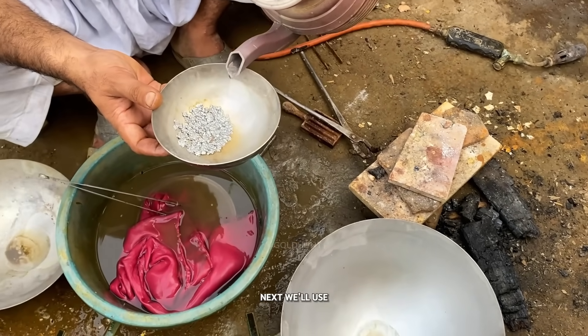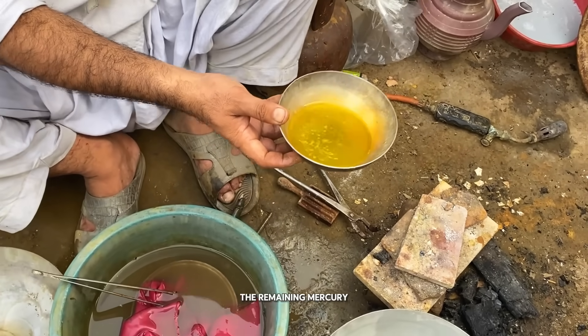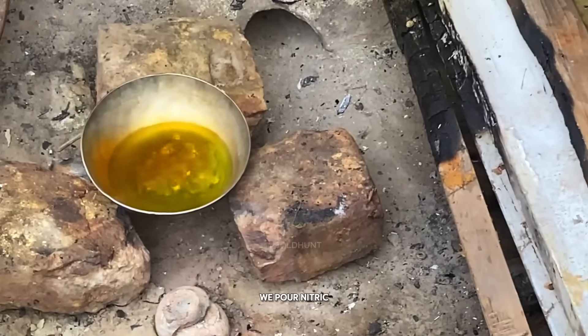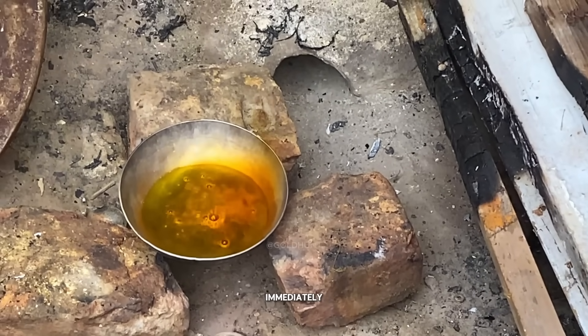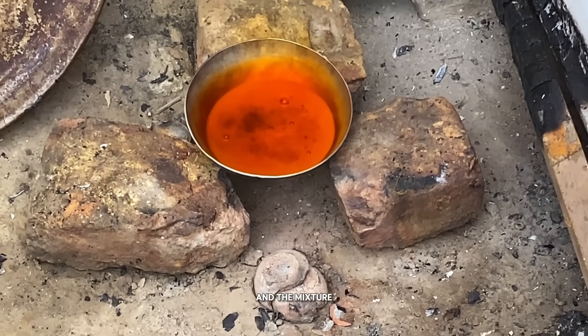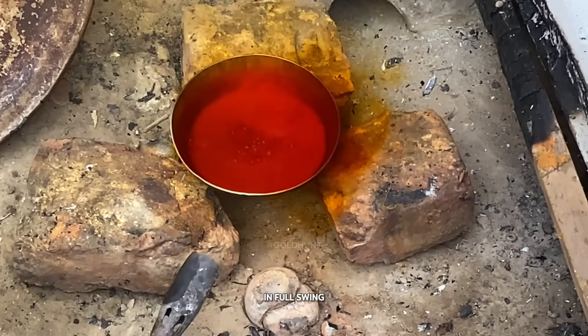Next, we'll use nitric acid again. This acid will dissolve and remove all the remaining mercury, leaving behind only raw, pure gold. As soon as we pour nitric acid, the reaction starts immediately. The color of the acid begins to change, and the mixture starts to boil. That means the purification process is in full swing.